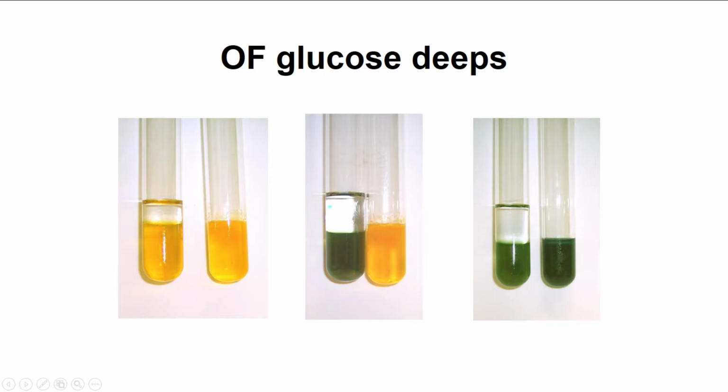Remember how we talked about green being neutral, so that means relatively nothing's happening if you have a green color. There's one last possible result, which is blue coloration, and a lot of times you'll see it in the green tubes, especially when it's open to the atmosphere. It'll turn maybe a little blue on the top here. Blue means that it's an alkaline byproduct.